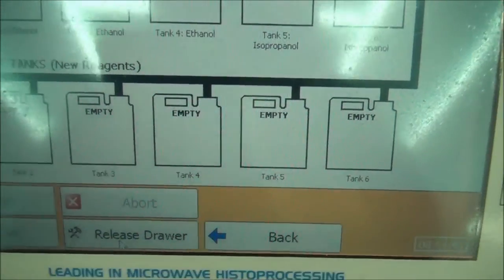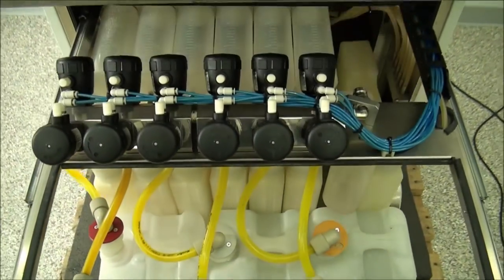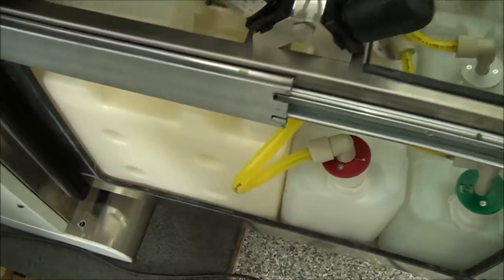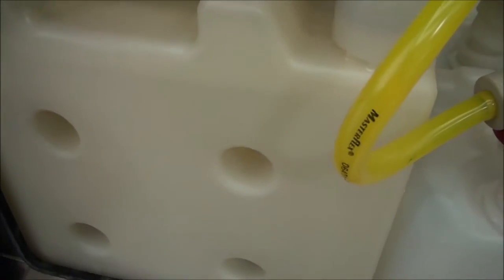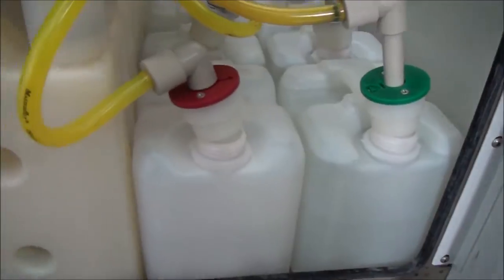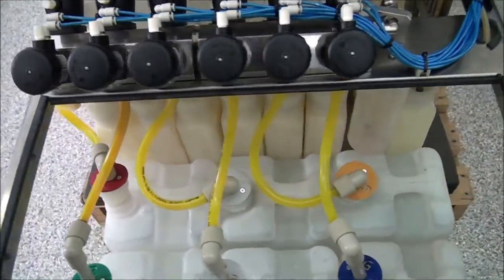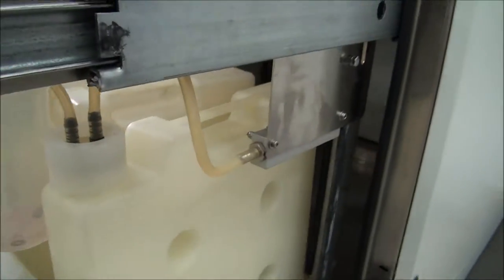I will now unlock the reagent drawer by touching the release drawer button. This allows me to open the reagent drawer. Once in this drawer, you can view or change the reagents in the tanks. While it is possible to fill the back tanks manually by removing them, the easiest and best option is to fill only the front tanks and use the prior shown process to transfer the reagents to the back tanks. When you are ready to close the door, make sure to touch the lock drawer button on the touchscreen, as most system functions are not possible while the drawer is unlocked.